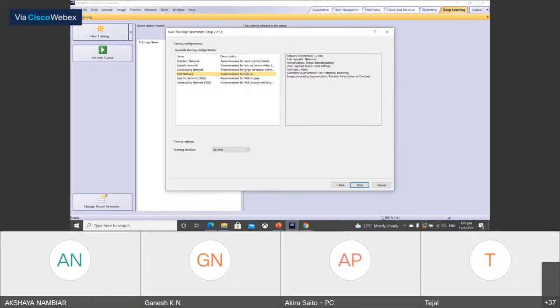And actually, our deep learning can be applied to the live image, so that we can show the objects, the segmentation result on the live image. If you want to do such kind of live segmentation viewing, then it's necessary to use this fast network algorithm for the neural network.